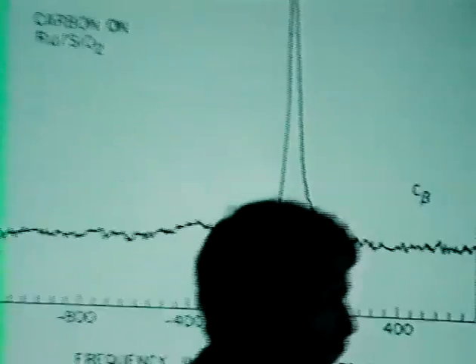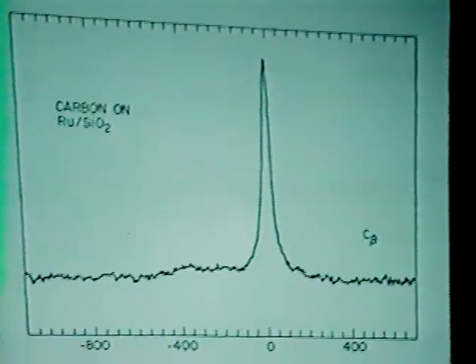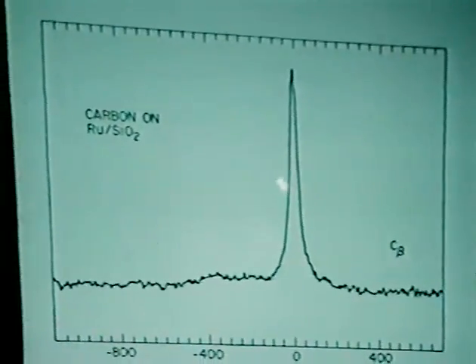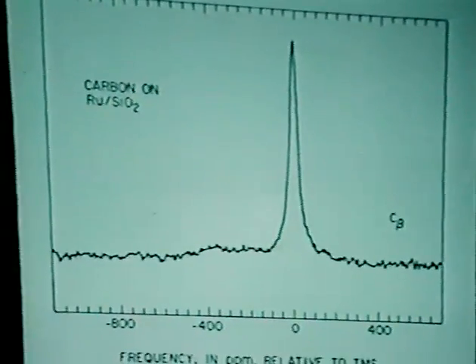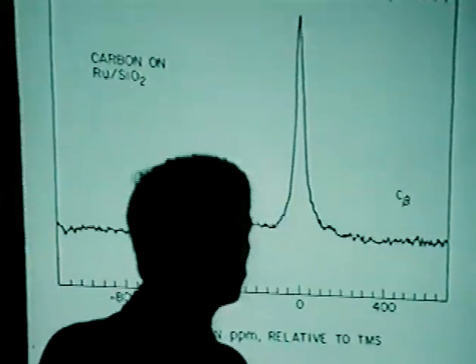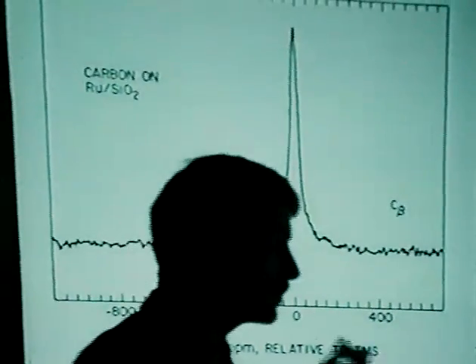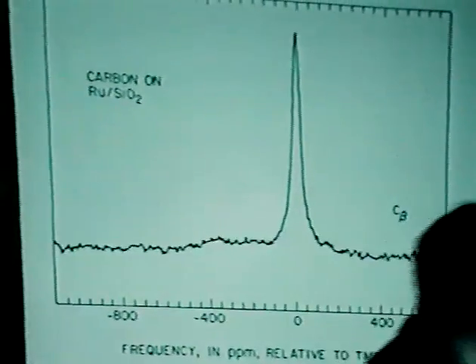And as I pointed out before, we see this peak that, at least on the scales I've been plotting it here, looks sharp. But clearly it's not sharp. It has a half width of about 50 ppm. And as you recall, separations for lines in high resolution NMR are often fractions of a ppm. All right, so we have a lot of different species hidden under this line here.